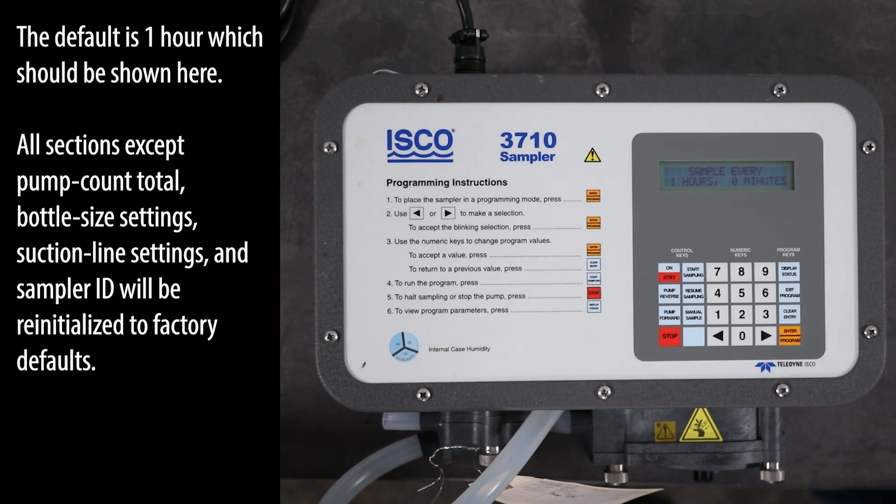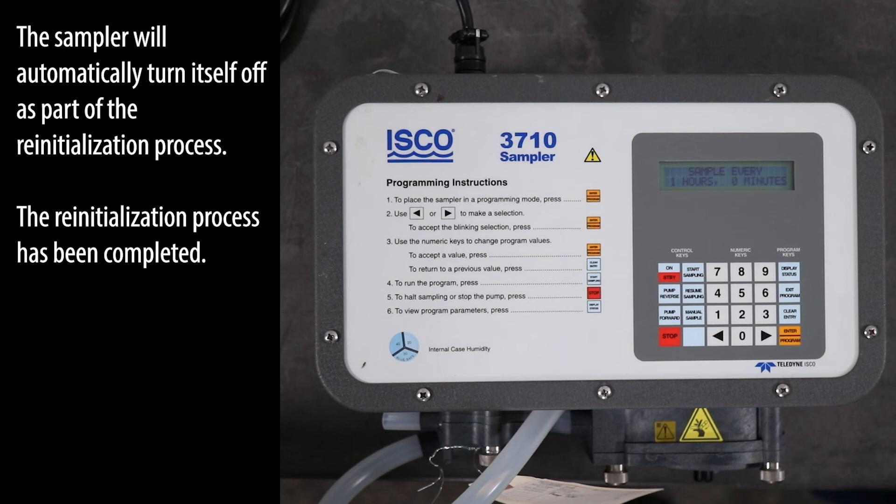All sections except pump count total, bottle size settings, suction line settings, and sampler ID will be re-initialized to factory defaults. The sampler will automatically turn itself off as part of the re-initialization process. The re-initialization process has been completed.